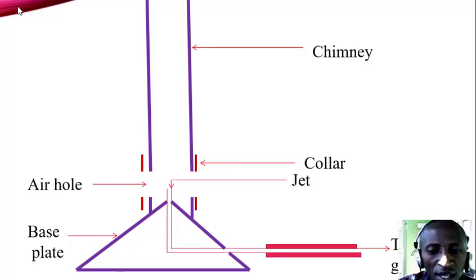Right. In the laboratory, one of the most important apparatus is the Bunsen burner. You find that the Bunsen burner is the chief source of heat in the laboratory. Anytime we need to heat something, be it over a flame or by heating through a beaker or boiling tube, the Bunsen burner comes in very, very handy.